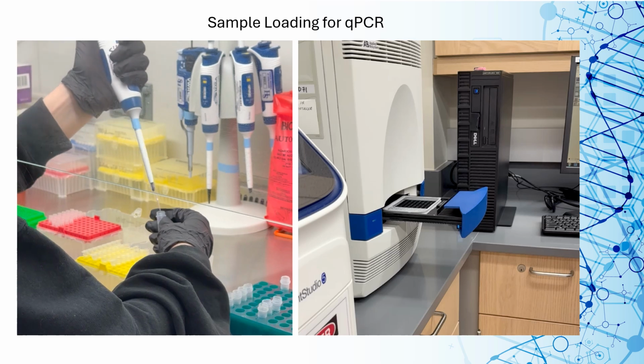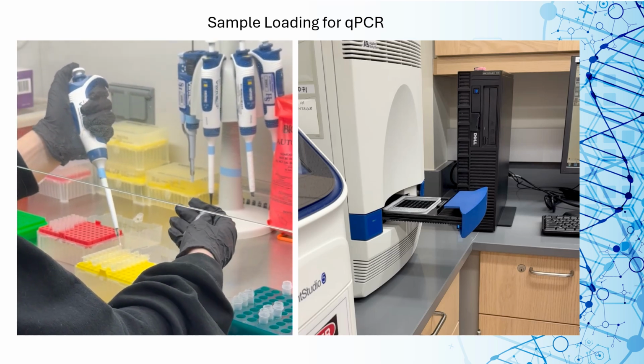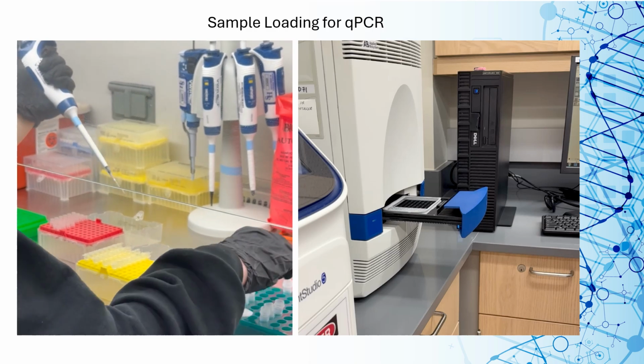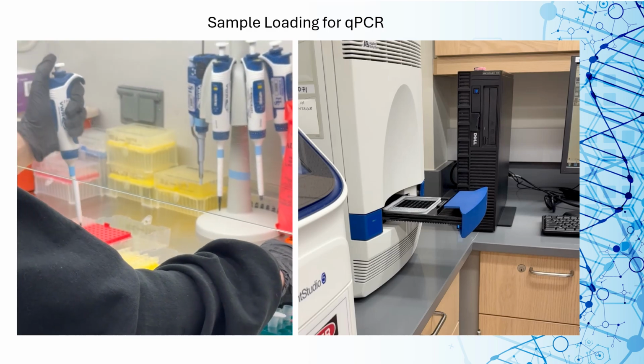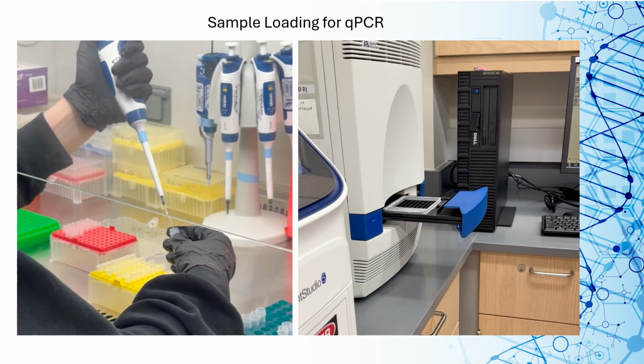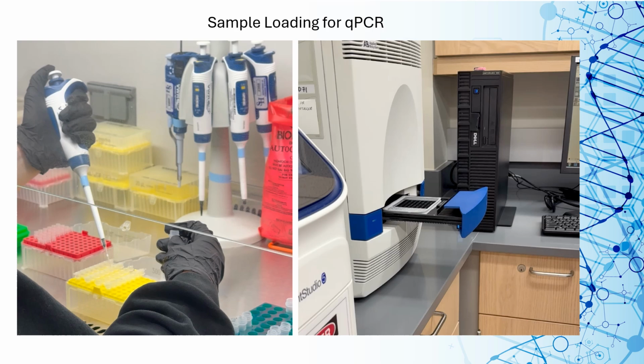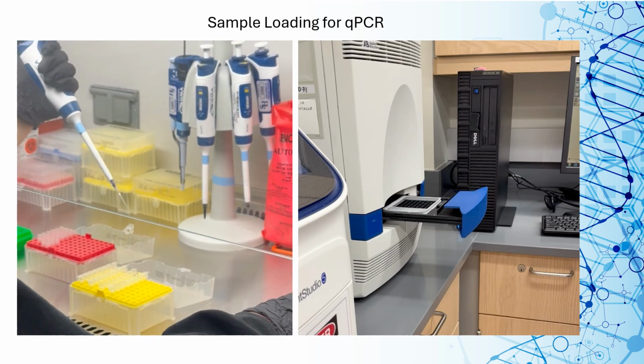After extraction, the DNA extracts are loaded into the sample plate along with the reagents necessary for qPCR. These reagents are provided by the commercial qPCR kit being used. Standards, also provided by the kits, are loaded into the first few wells to provide a baseline comparison that is used to determine the amount of DNA present in the samples.